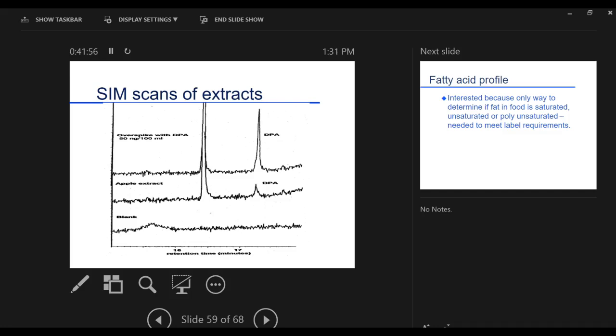So if we go back to this chromatogram. Here's our time here. One of these pieces is our diphenylamine. If we take a look at it, this is the diphenylamine over here. And that's about 18, 19 minutes. So if we could go back to around 19 minutes, we'd find a peak for diphenylamine. And so here's our apple extract. 169 is in this molecule that eluted around 16 and a half minutes. Okay, but there's also a peak here for 169 that's out here. That elutes at 17 and a half minutes. And so this is it. How do we know this is the right one? We take our apple extract. We add a little bit of pure standard and inject it again. It's bigger. Good. It increases. That's the right compound. And so we monitor it here. So we've got actually fragments of that in our apple extract. We can quantify that. So we use gas chromatography for separation. We do mass spectrometry to make it simple to identify what's what.